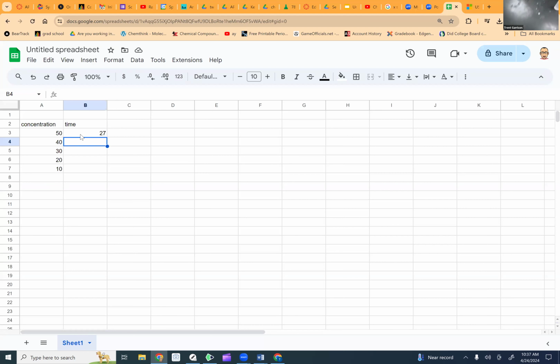And so what you'll notice over here, first off, there's a horrible stink on it, but you notice how you can no longer see that X at all. It's whenever we first see it. So we're going to do this for each of the same materials, and we're going to time it. So let me get 5 more milliliters of acid, and we'll do the same exact process.